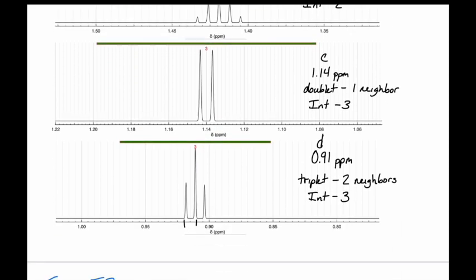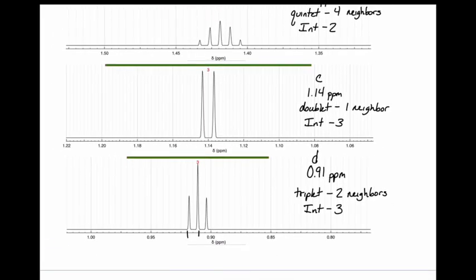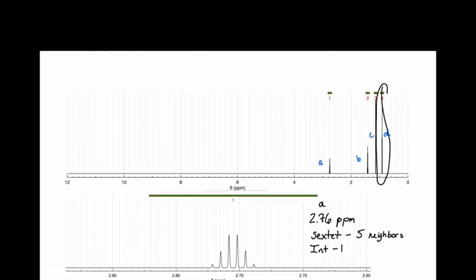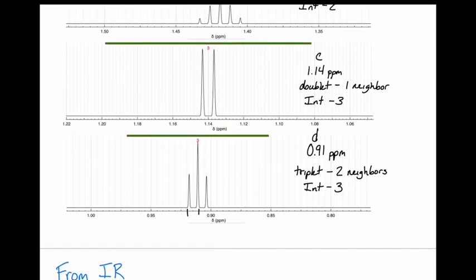All right. There's something else I want to point out about analyzing NMR spectra. There's 2 other things about this spectra that really jump out to me. One is that the lowest possible number here, which is usually the lowest ppm, is in terminal carbons. And indeed, this one has an integration of 3, so there are 3 hydrogens, and it's next to a carbon with 2 neighbors.